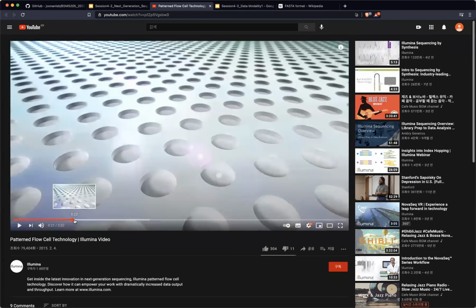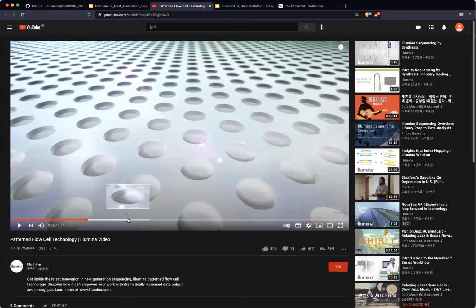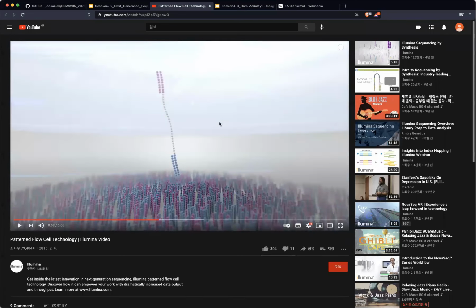So if you look closely, it has each tile's information here, right? And each individual tile has sort of these priming stations. Your library gets into each tile, does the priming and binding, and processes the sequencing information. But why do we care about the tile information and tile position? The reason is, back to here.